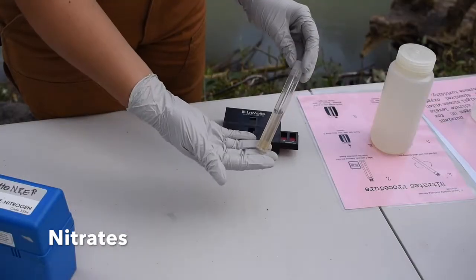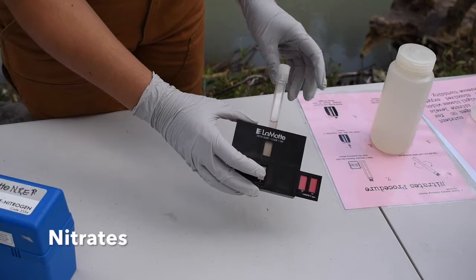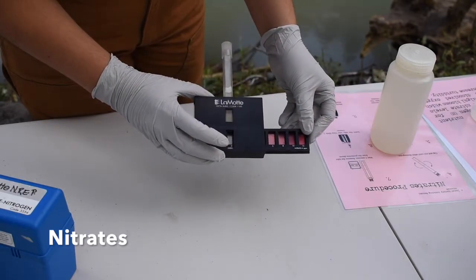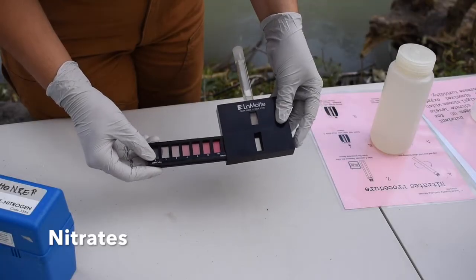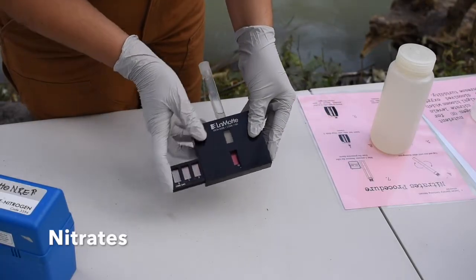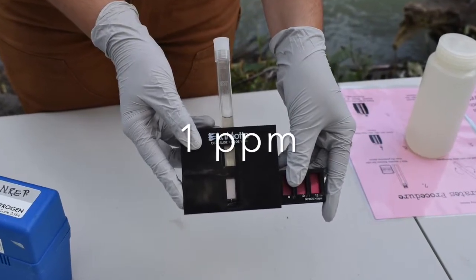After 5 minutes has passed, we remove the tube from the sleeve and slide it into the octaslide viewer. We then move the slider until we find a color that matches our sample. This sample matches the color that corresponds with a nitrate value of 1 part per million.